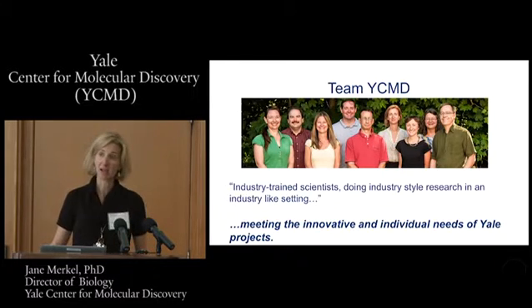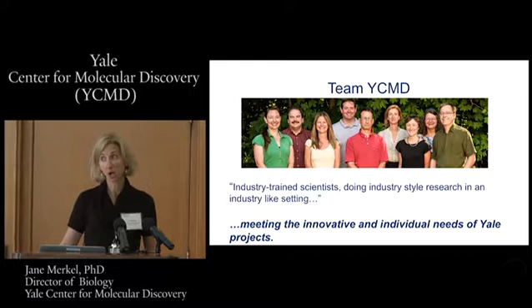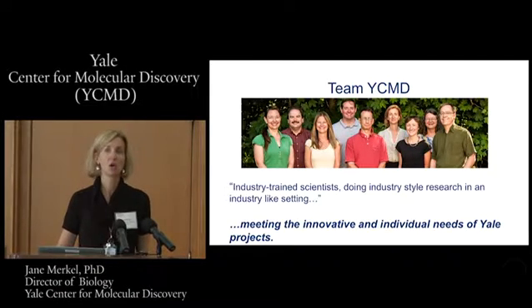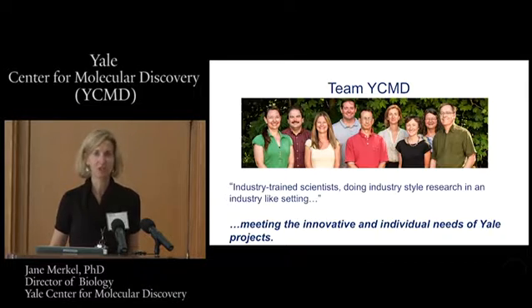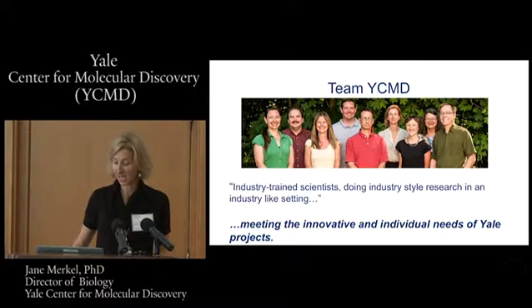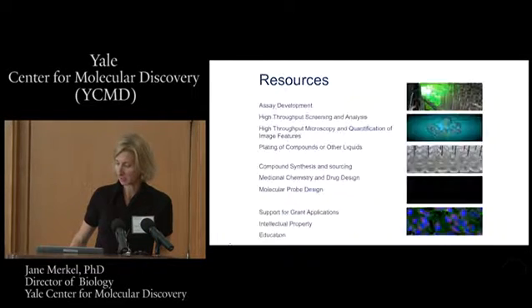We do biochemical assays like enzymatic assays and protein-protein interaction. We do a lot of cell-based work, both animal and human cell line work, image-based assays, and we work even on whole organisms. Our small molecule collections are in 384 well plates, so we're using small organisms like nematodes or algae or pathogenic bacteria or yeast or fungi, all sorts of things, but typically quite small. We can go to 96 well format if we have to. We actually had a summer intern doing 3D spheroids this summer in 384 well plates.